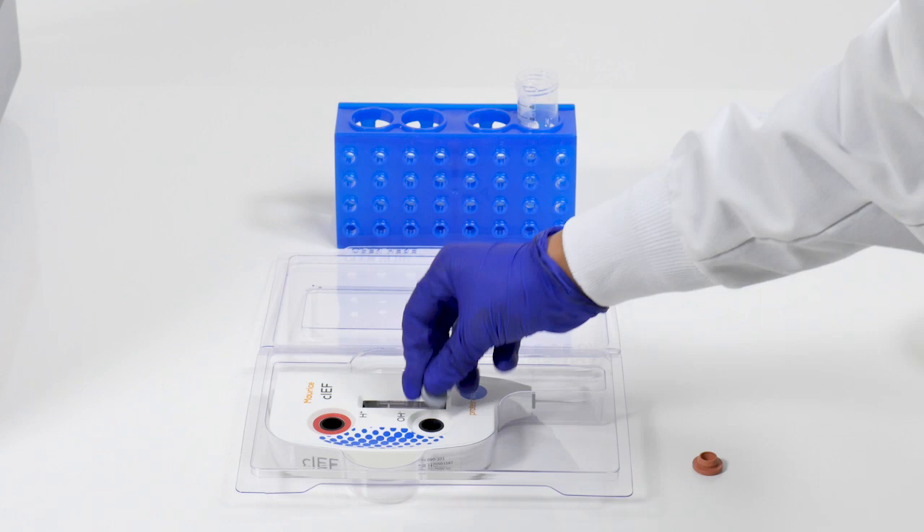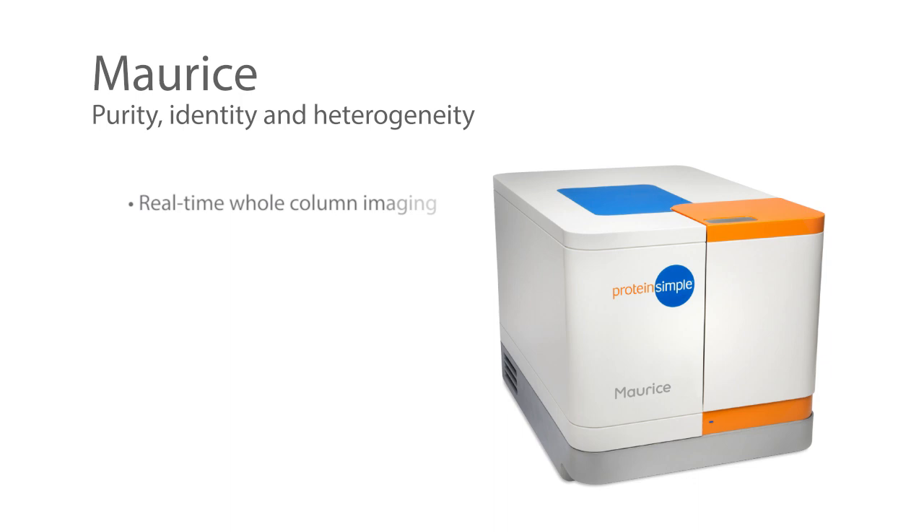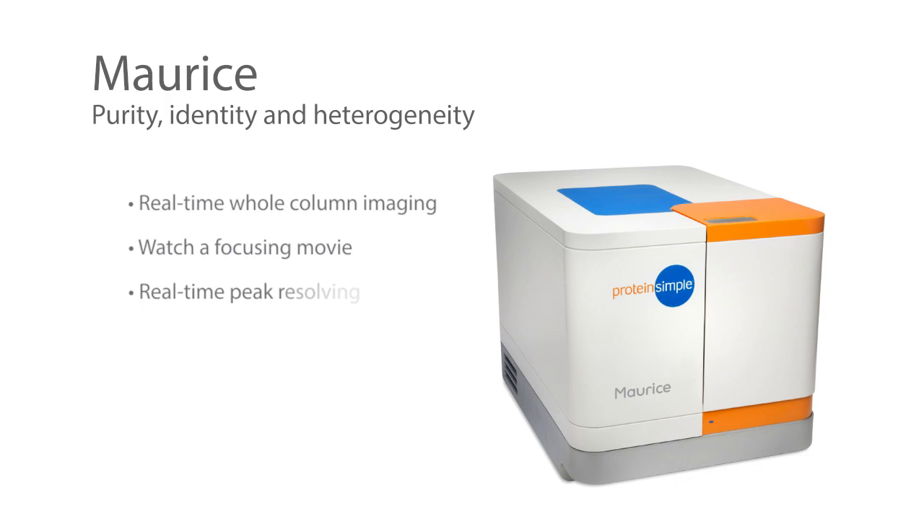After approximately 24 hours, the gray and red plugs can be reinserted into the cartridge. CIEF on Maurice utilizes real-time whole-column imaging — the ability to watch a focusing movie, see the peaks resolving in real time, and immediately identify any precipitation or aggregation issues — shortens time to results, increases resolution, and greatly facilitates method development.